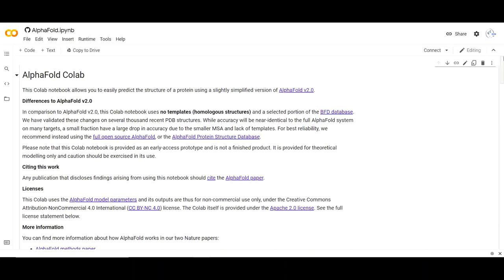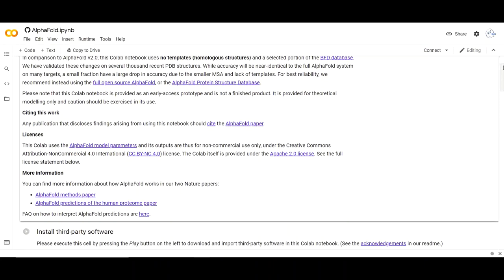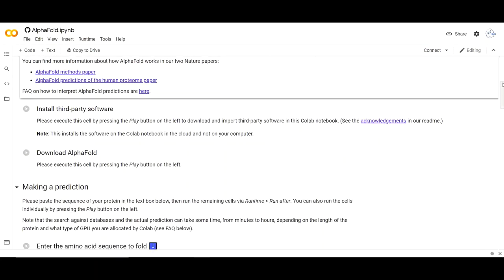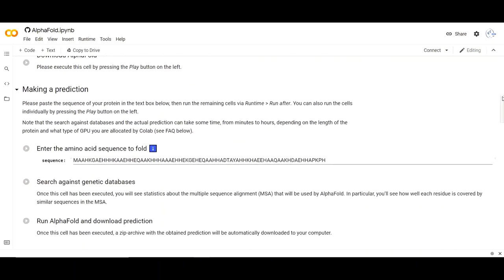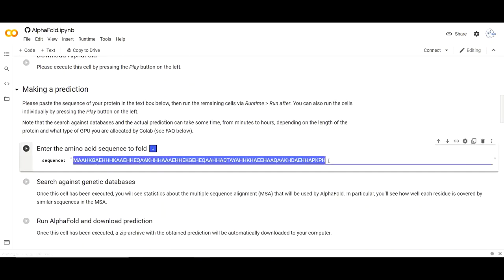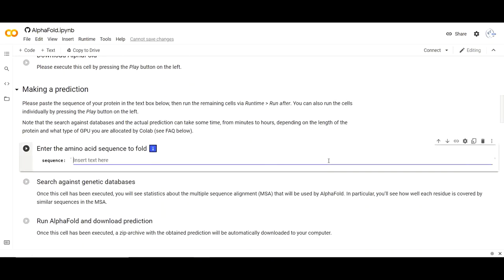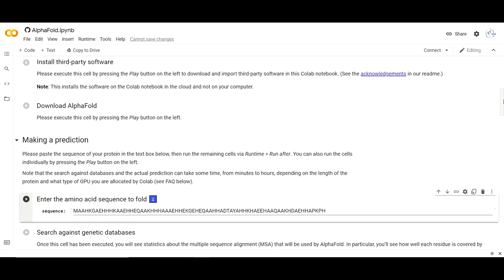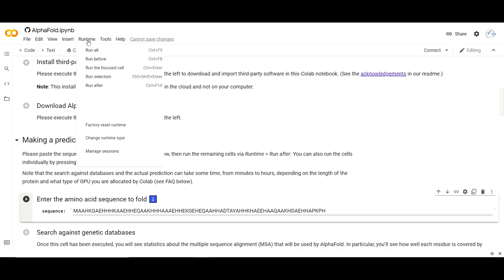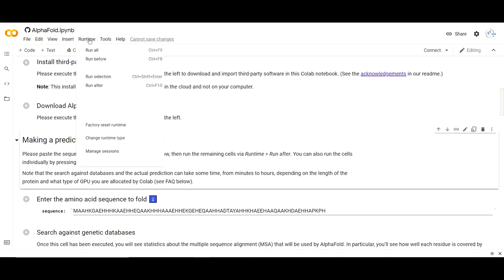On this Colab notebook, you need to scroll down and then just copy and paste your protein sequences here. After copying and pasting your protein sequences here, you need to come up to Runtime, click it down. When you click, there will be a dropdown menu. In this dropdown menu, simply click on this Run All button.